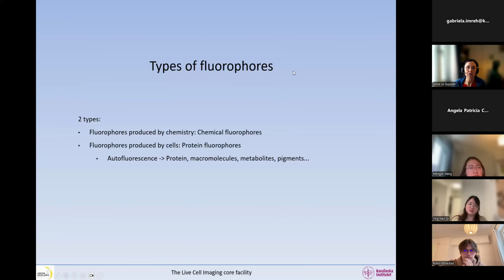So now I'm going to talk about the different types of fluorophores. So there are basically two types of fluorophores. And maybe those people from Ireland here who are developing fluorophores, if I say something wrong, I want you to tell me. Thank you. So there are some fluorophores that are produced by chemistry, so chemical fluorophores, and there are fluorophores that will be produced by the cells, and these are protein fluorophores, okay?